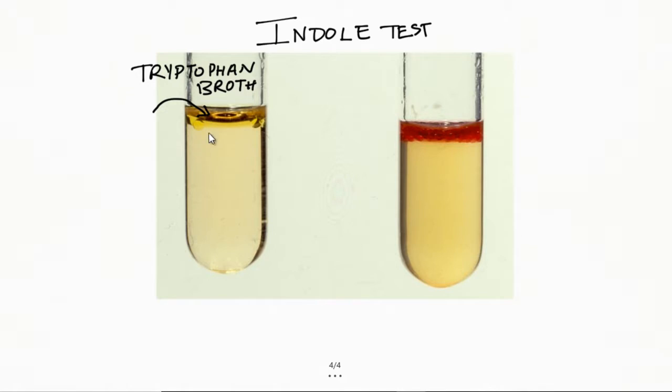Okay. And what happens is that if bacteria are present in this tryptophan broth, then they will have a tryptophanase enzyme, and they will produce indole.